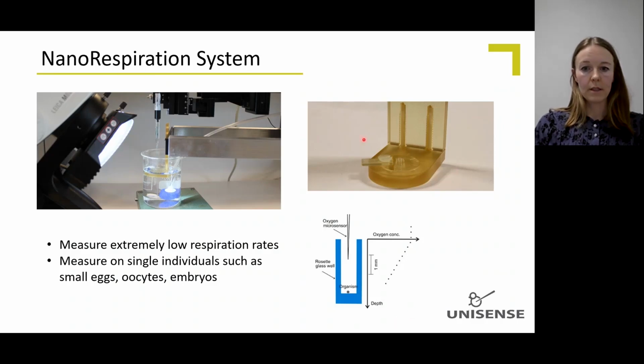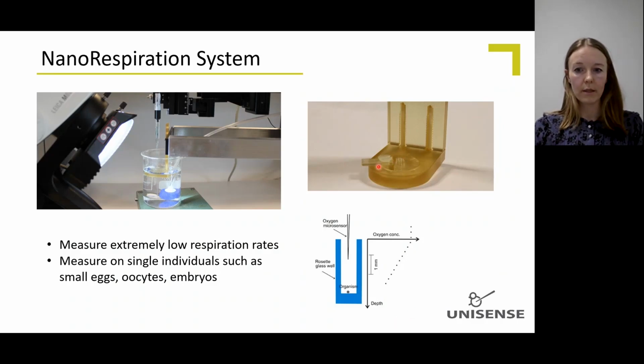The system consists of a small rosette with small glass capillaries where the sample is placed. And the microsensor is then positioned on the micromanipulator as shown here on the photo.